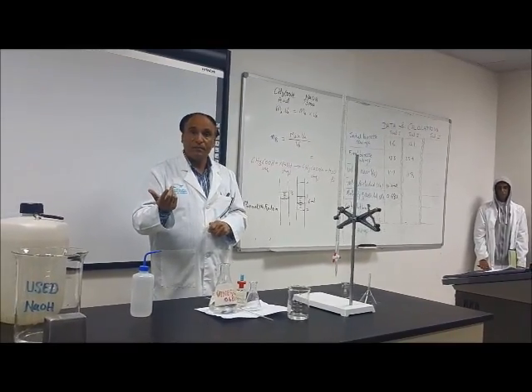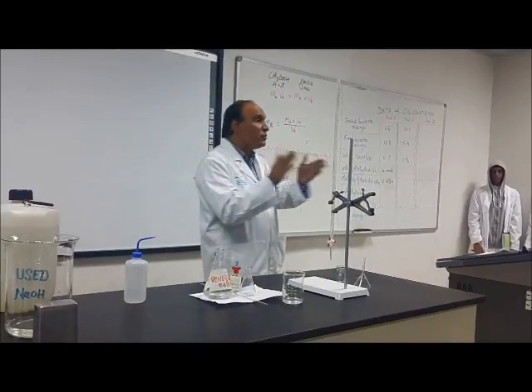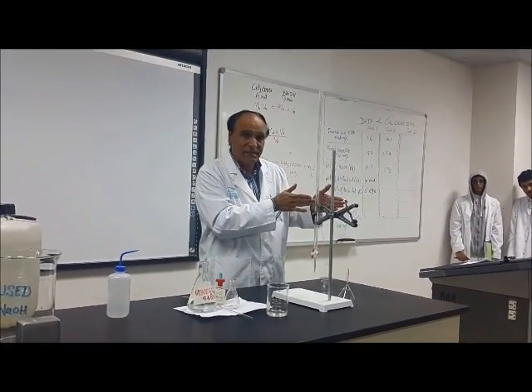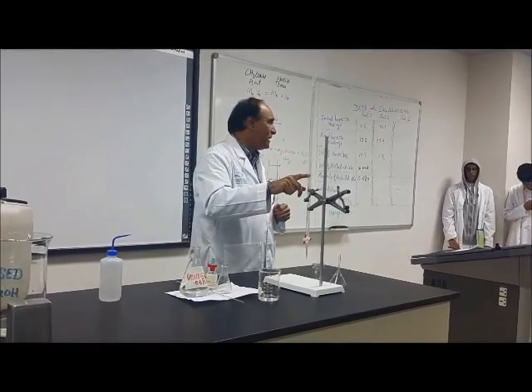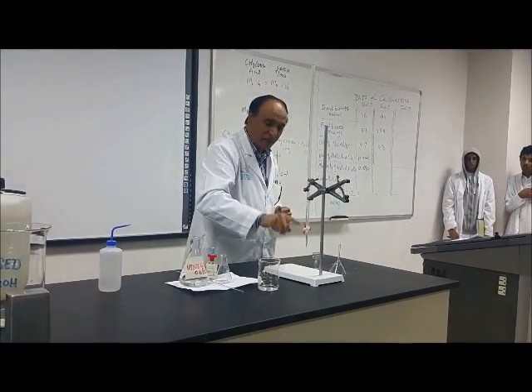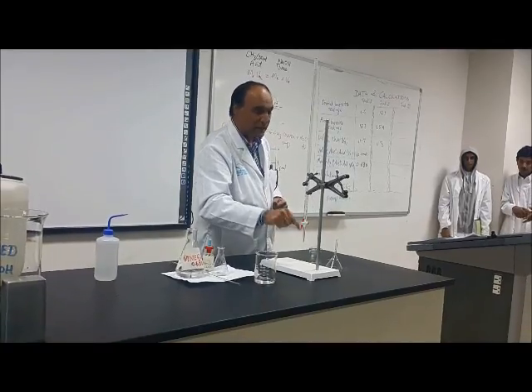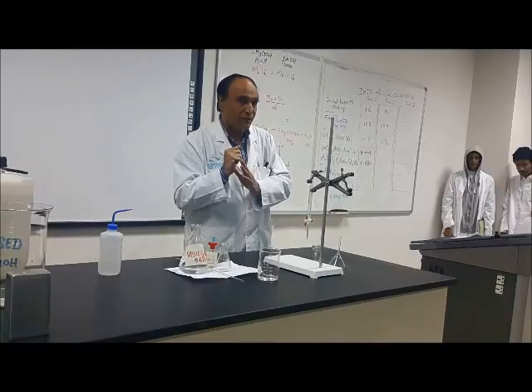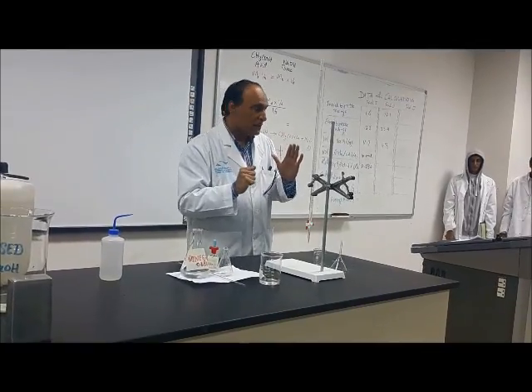Carbon dioxide. Carbon is a non-metal. Non-metal oxides are acid. Metal oxides are base. So there is carbon dioxide. It will react with this one, and the tip of this burette will be blocked because of the solid. Sodium carbonate is solid. Did you understand?